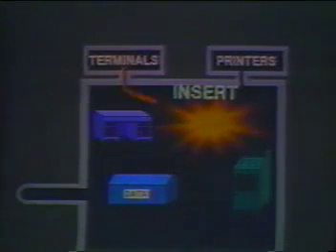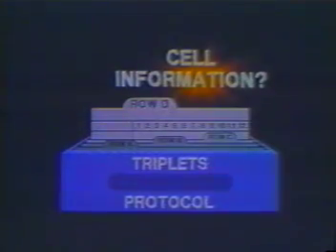The second time Tom gave the Insert command, the cursor was at the lowest level of his protocol collection drawer. The Secretary then responded by prompting him to enter a cell or reagent description. Insert is therefore a generic command that allows you to insert new information into your desk.